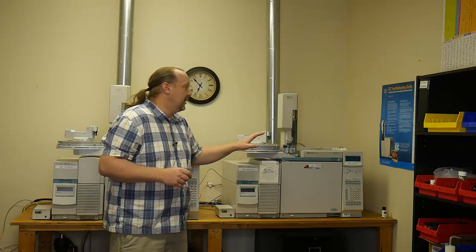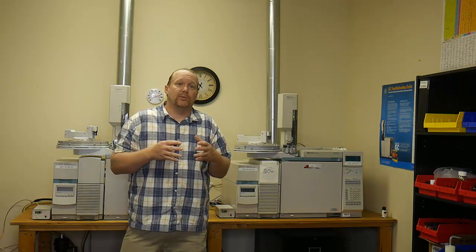We first started the company, we bought one GC. Within a year, we ended up buying the second. And both of these pieces of equipment are six figures apiece. We got so busy, we actually bought a third and we're actually currently looking for a fourth. So when we say it takes two weeks for a duplication, it's because we have such a backlog going through these machines.